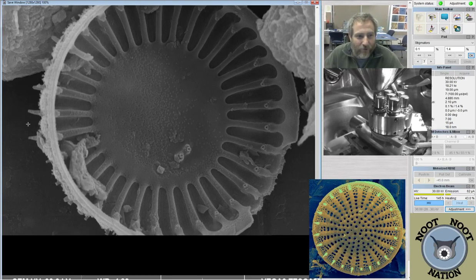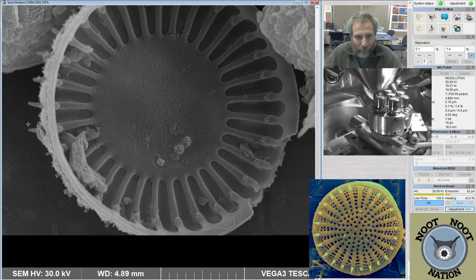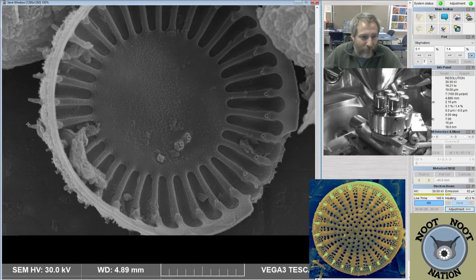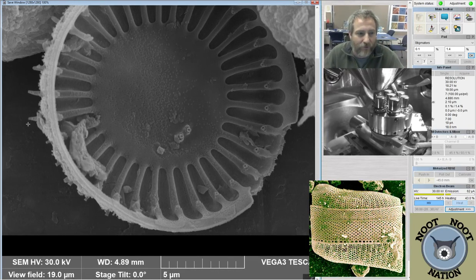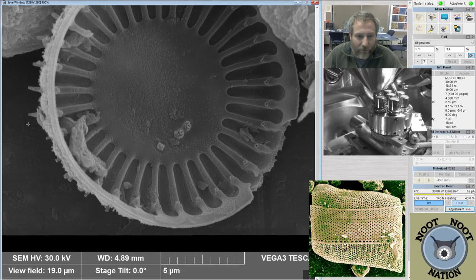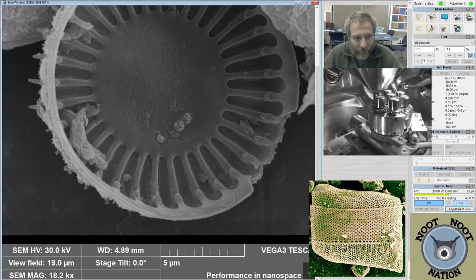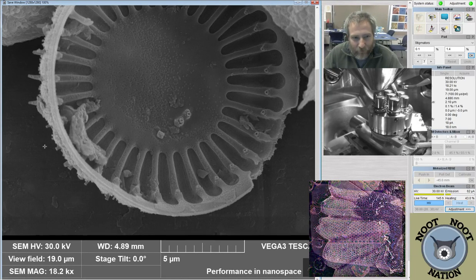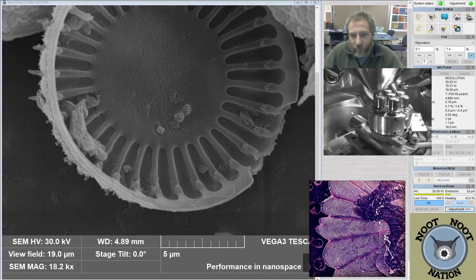It's a regular question that I have, which is why do diatoms need spines at all? In some cases, it's clearer when they have really long spines, or they use them to connect to their neighbors. But these ones don't do that, and they're not that big. So it's a complete mystery to me. What are they doing wasting a bunch of silica, which is a precious resource for them, on spines?